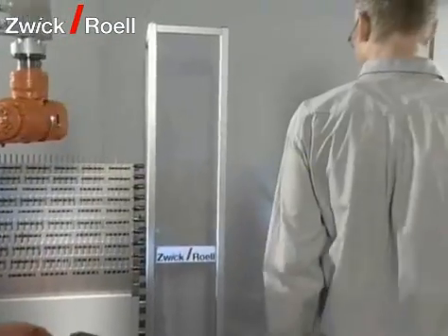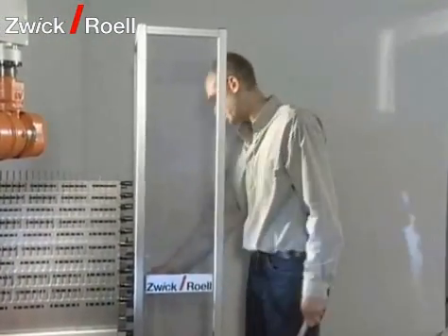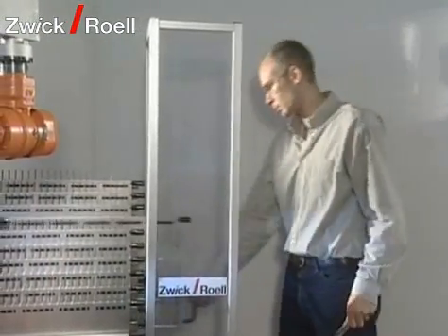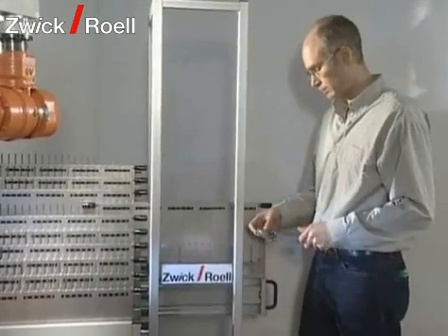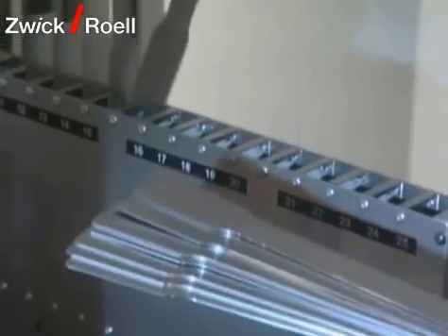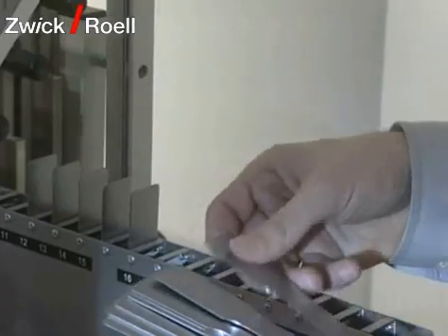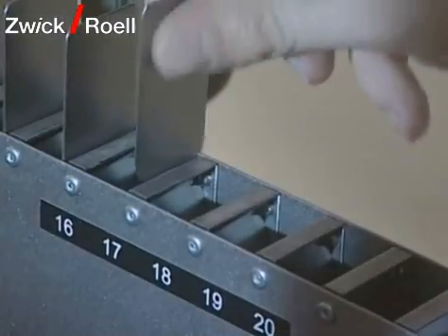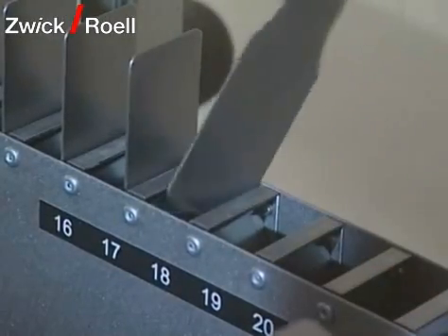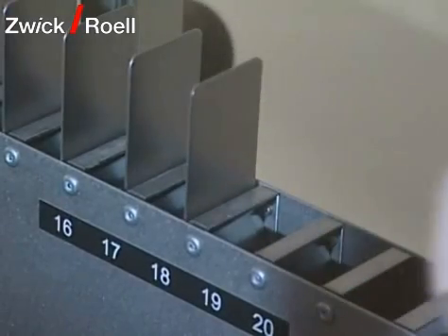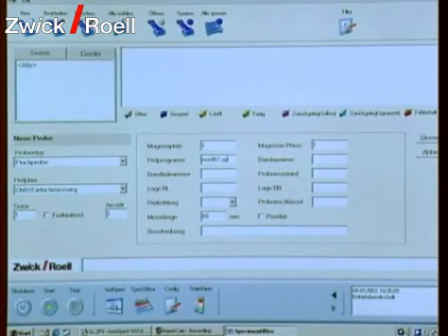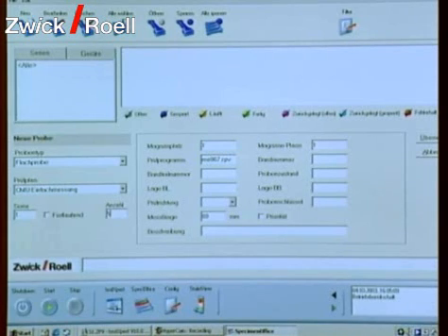Now follows a typical specimen throughput. First, the operator feeds the specimen holders with specimens outside the danger zone. One specimen holder can hold up to 25 specimens. These specimen holders may also be taken out of the magazine to refill them outside the magazine. Then the magazine is inserted again and the operator enters the corresponding data of the test series into the database.